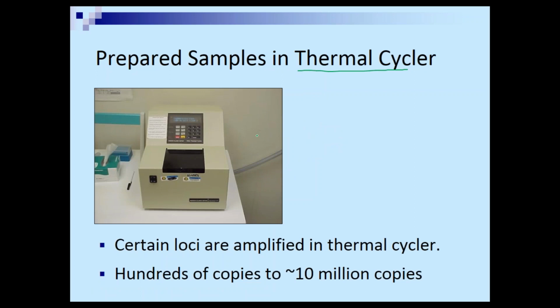How does the DNA amplify? Well, this box is literally something that heats up the tubes and then cools them down. It heats them up and cools them down.